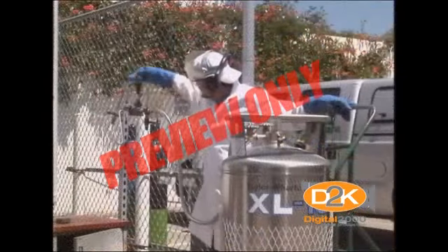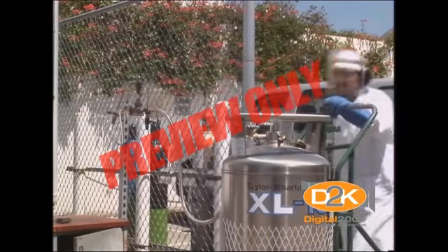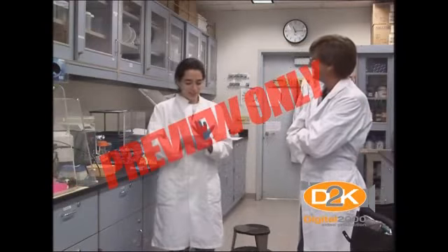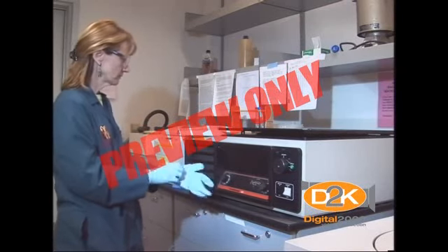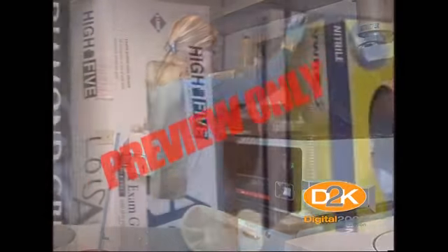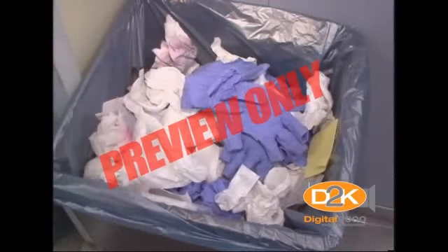Face shields alone do not provide adequate protection against large projectiles or liquids unless they are used in combination with safety goggles. Safety gloves should always be worn when working with chemicals. Gloves should be comfortable, of sufficient length to prevent exposure of the hand and wrist, and should be appropriate for the type of work to be performed. Gloves should be inspected for visible tears before use, changed when they become soiled or compromised, and discarded appropriately after use.